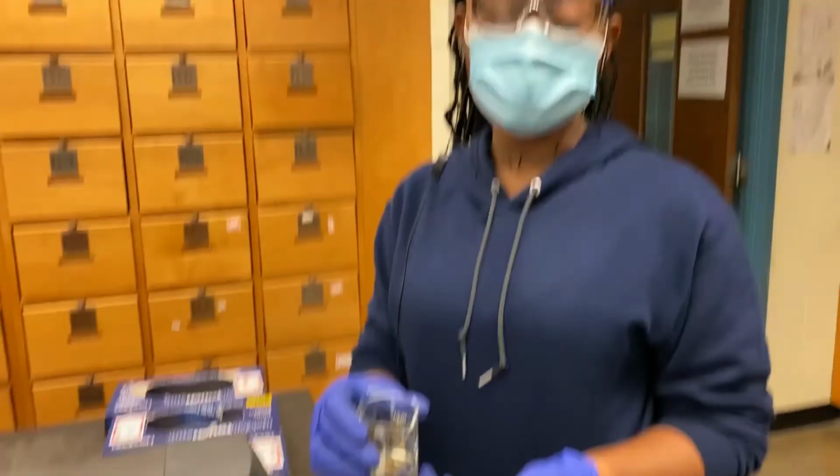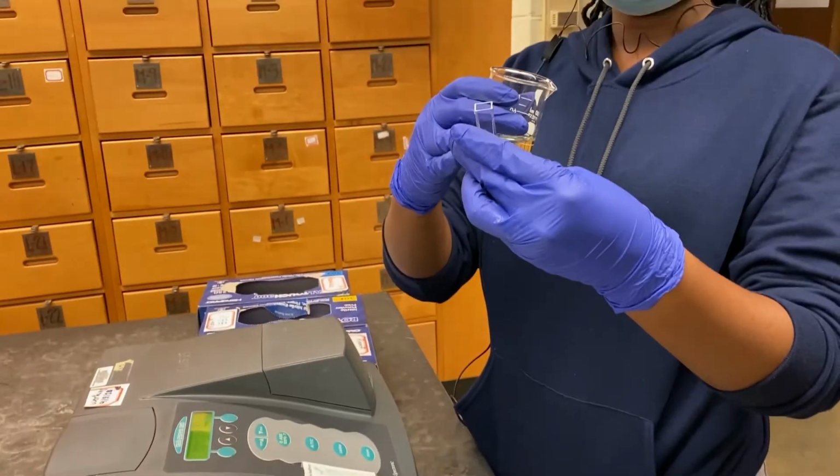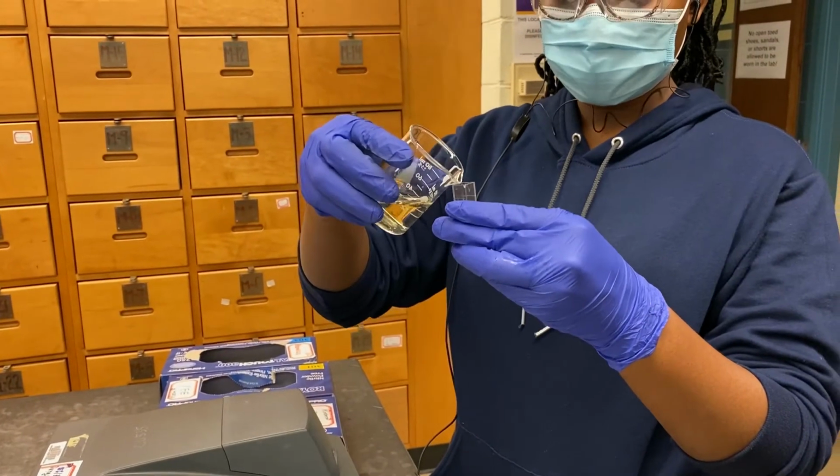This is after 20 minutes. I'm about to check the absorbance. So I'll put this in the cuvette. I just need it to be about 2/3 full, not so full.